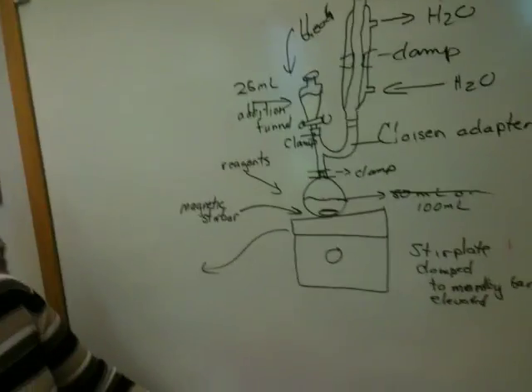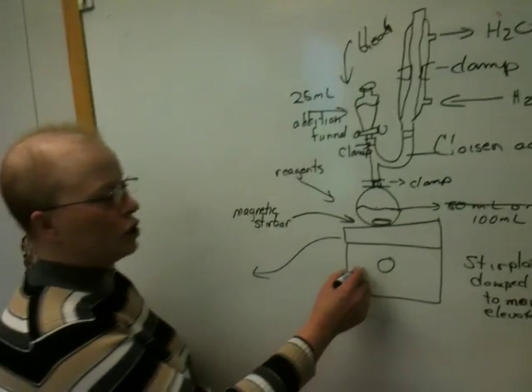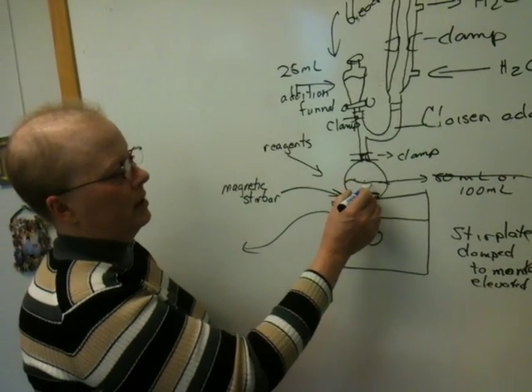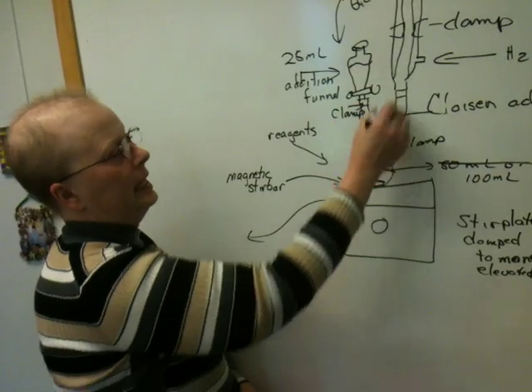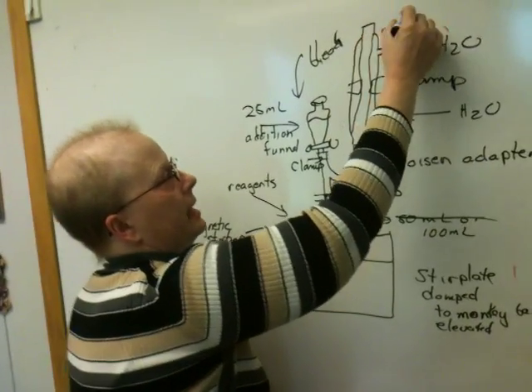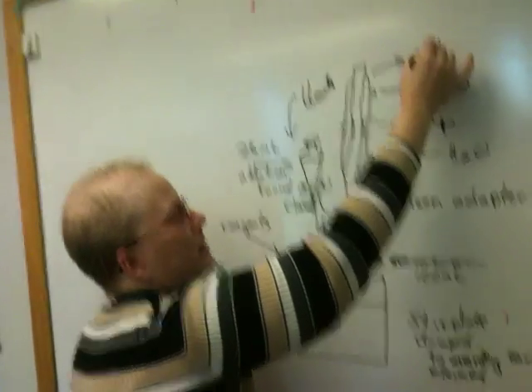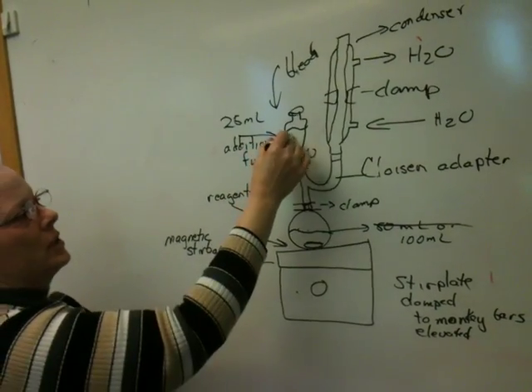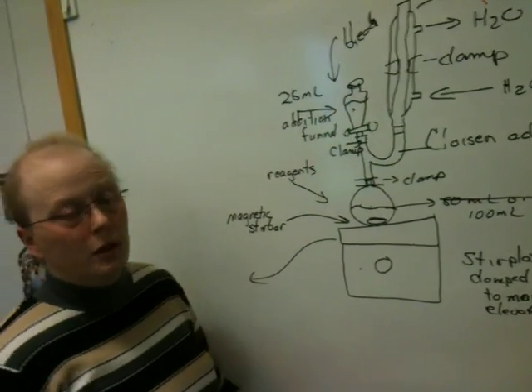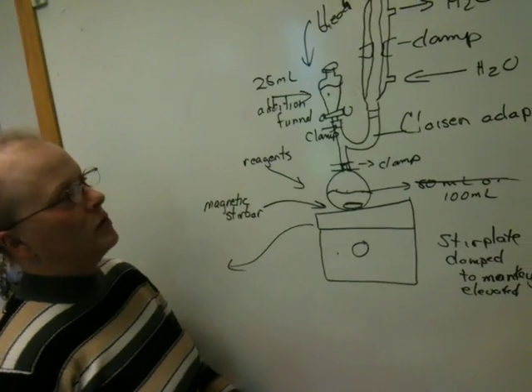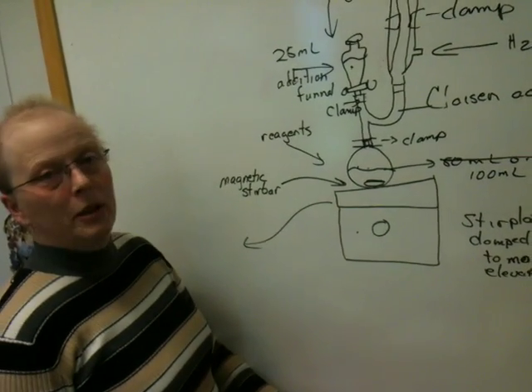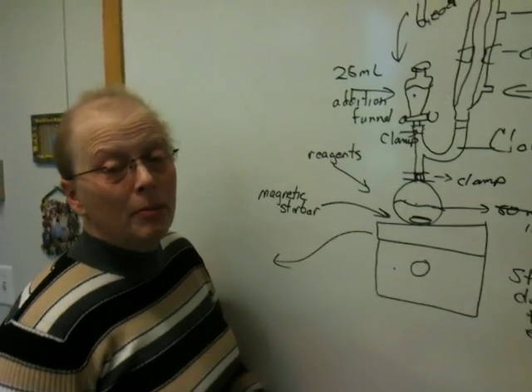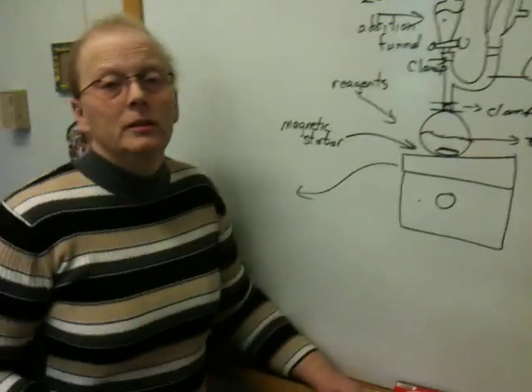So, I hope this makes some sense. Again, stir plate, not a heat plate. 100 milliliter round bottom. Claisen adapter. This is a standard condenser. Notice the top is open. The bleach is going to go into this addition funnel, which you've been using as a separatory funnel. I hope this equipment looks somewhat familiar to you. So, I'll see you in class. And, again, we are happy to help you. Don't worry if you need some help. Thank you.